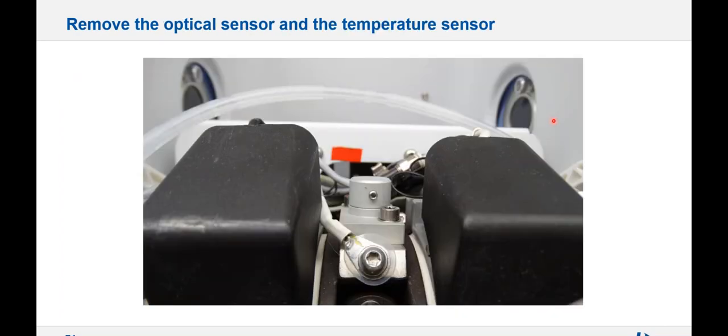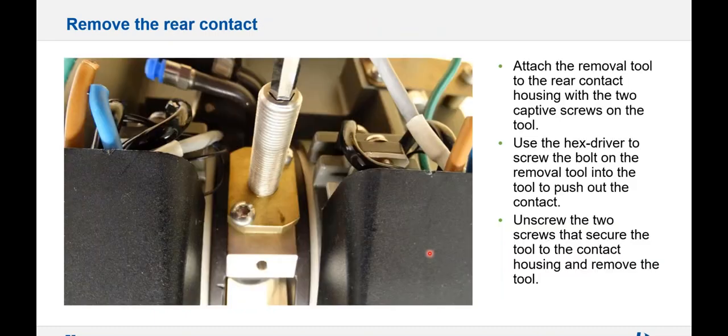For the other contact cylinder, you need to remove the optical sensor, and the optical sensor is right here, and the temperature sensor, which is right here. So you want to remove those before you remove the contact cylinder.